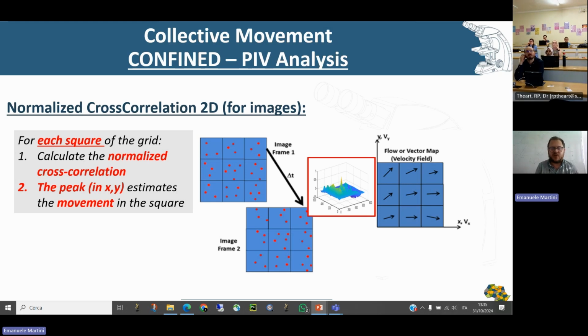So if you really want to go deep, you can open a physics fluidity book, and you can start to check a lot of stuff about how your cells are moving in your different conditions, with a treatment, with a drug, with cells that are coming from a tumor cell line, cells that are not, that are sane, healthy. So you can really say, okay, it's a very useful tool now, because I'm able to use a whole field of physics that is the fluid dynamic field and apply it to my biological problem.